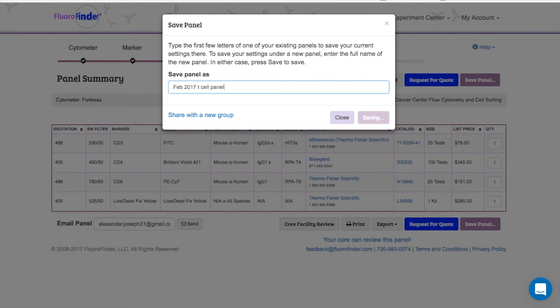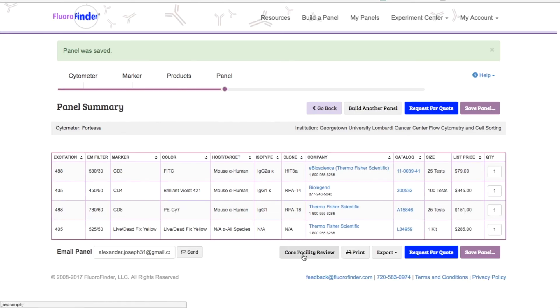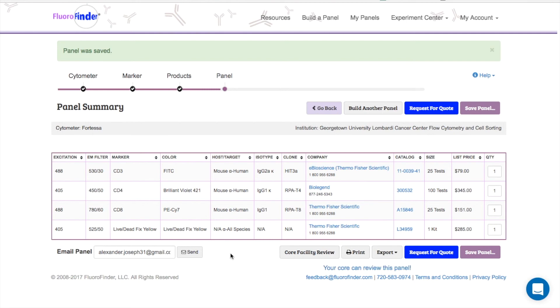You can also print or export a copy of your panel to keep for your own records. If you're new to flow cytometry, this send for core review button is really handy. This will send a copy of this panel to your core manager so they can give it a look before you go and start ordering products for staining cells.